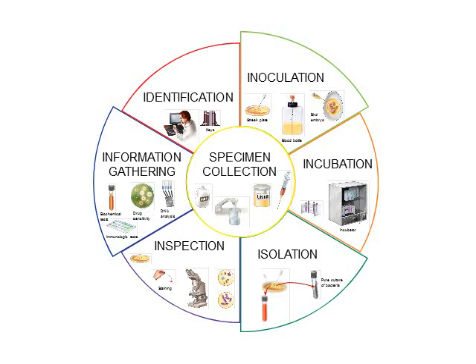So you can get this information from your inspection part. You can also do biochemical testing, which we'll do the second half of the semester. You can do drug sensitivity testing to figure out what drug works against your bacteria. You can even do DNA analysis to identify that specific species of bacteria. After you gather all that information, a lot of times you actually want to identify what the bacteria is, especially when we're looking at human or animals and we're helping to treat those humans and animals.